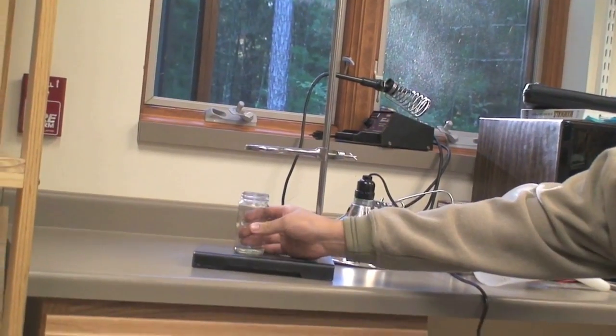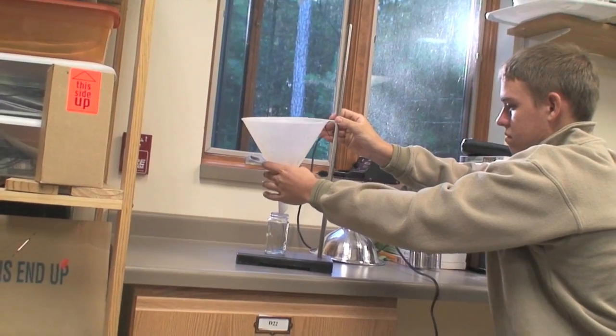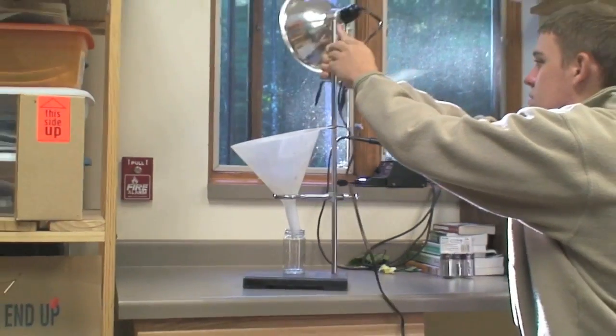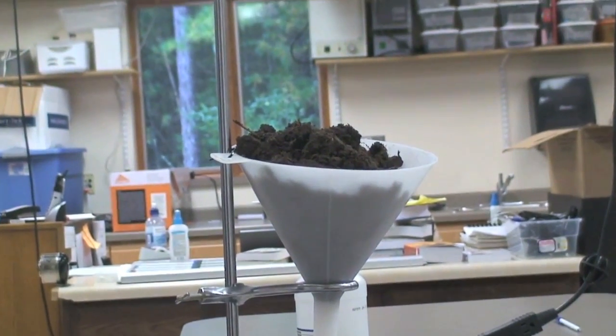Place the jar of ethyl alcohol underneath the funnel. Attach the funnel to the ring stand. Clamp the heat lamp to the top of the ring stand and angle it towards the top of the funnel. Dump the soil sample into the funnel.